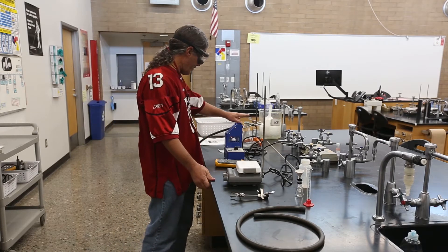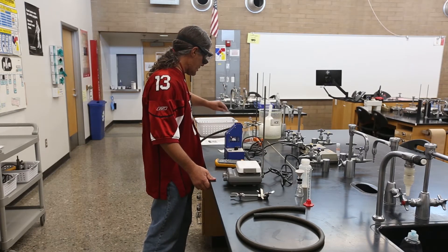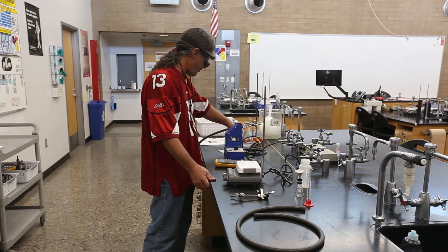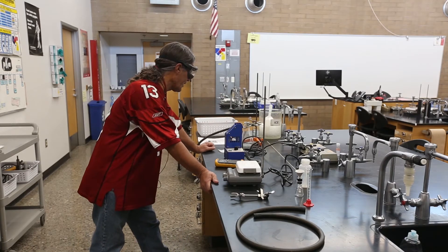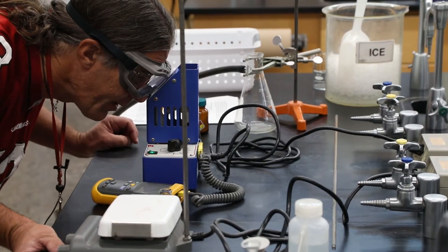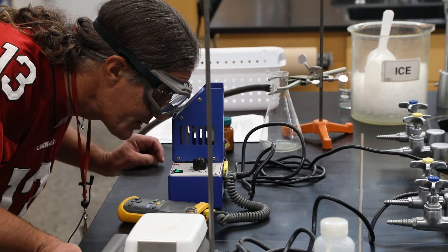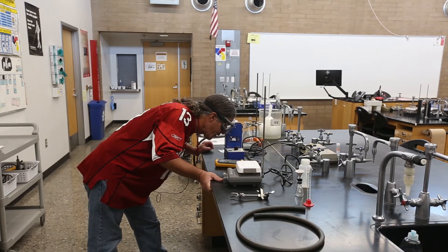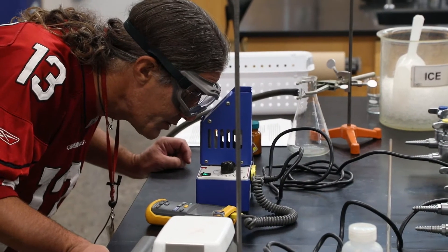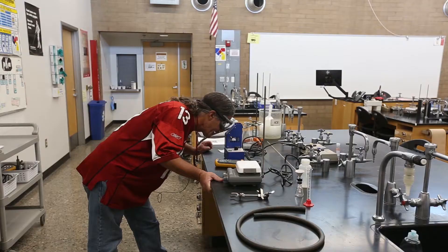We have a vacuum trap set up so that if any solution escapes the filtration device, it falls into this trap flask rather than reaching the vacuum pump and destroying it. The liquid stays in the trap and won't reach the vacuum pump. We're up to 79°C with no melting yet. I should also note that the melting temperature of urea matters — a mixture can sometimes melt lower than either of the two individual compounds, which is bizarre but experimentally observed.